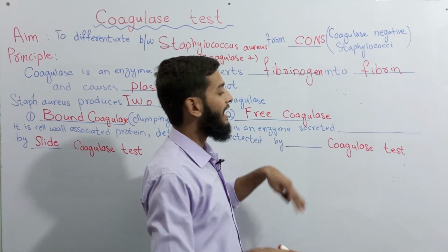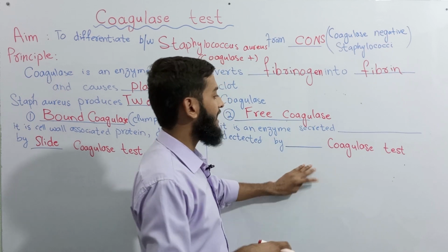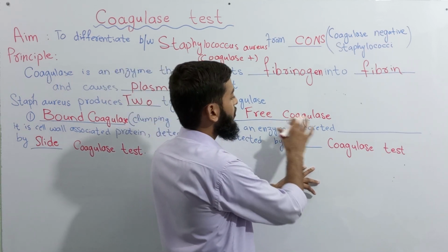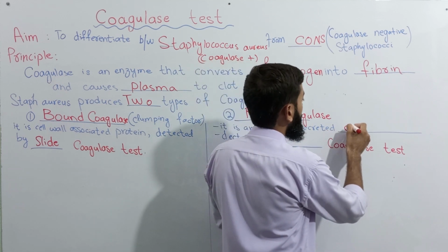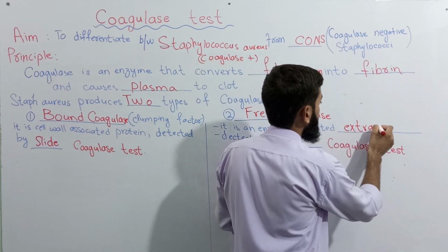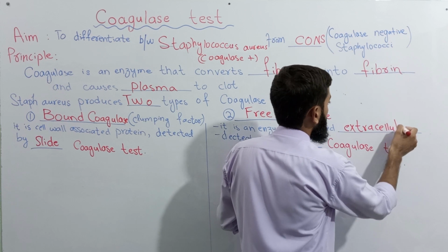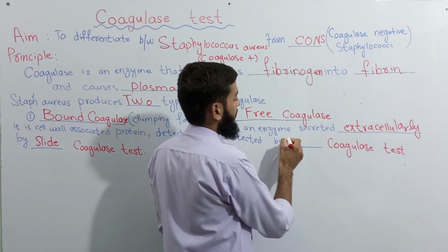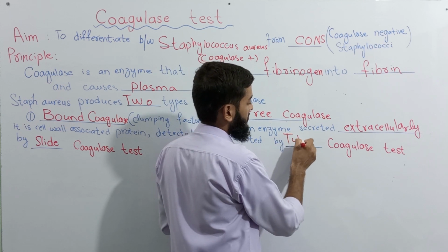So it is secreted extracellularly and detected by the tube coagulase test.